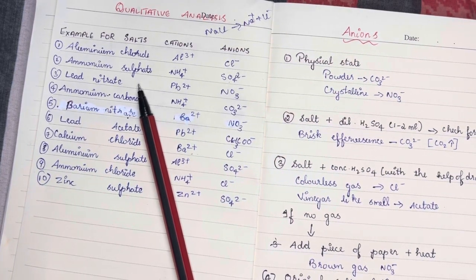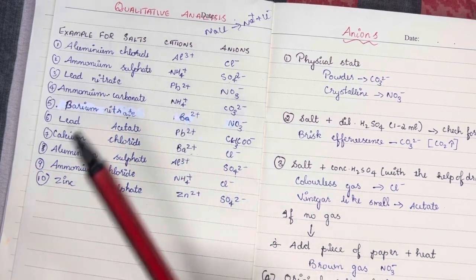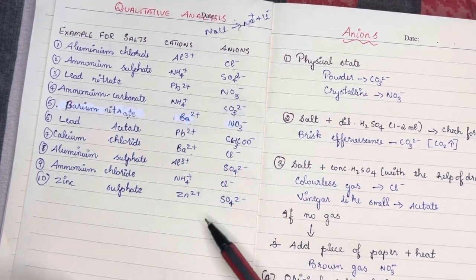So in today's class, we'll be doing the qualitative analysis in which we will be analyzing the salt, that is, the cation as well as the anion present in the particular salt. You will be given the salt, and you have to find which is the cation and which is the anion. The salts given as examples are the salts which will be given for your practicals.